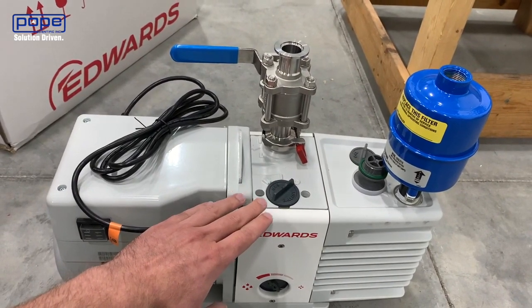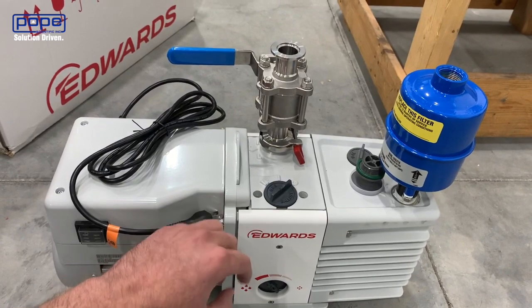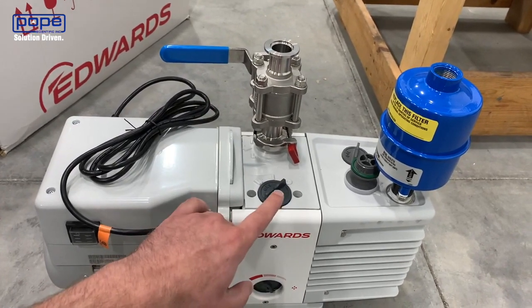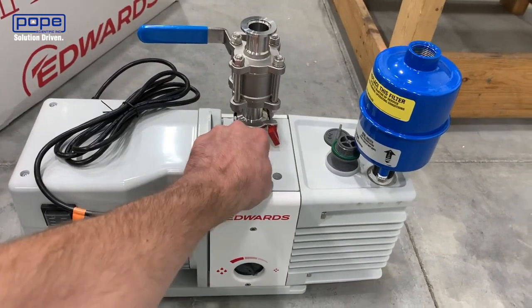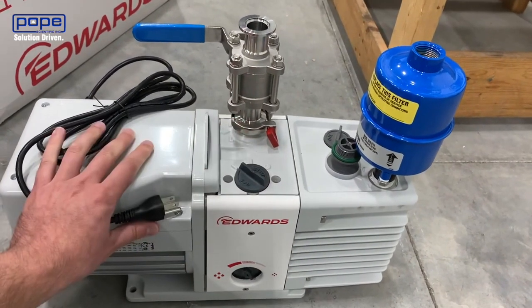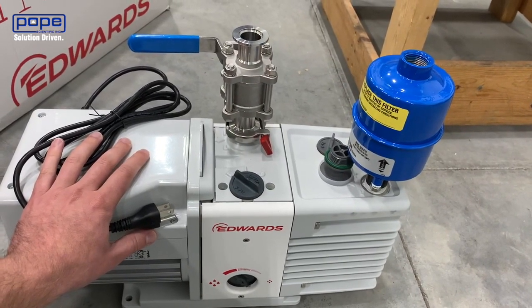When you're using it, you would wait until your vacuum pump is warmed up and then open it by adjusting it from zero to two — just change that switch over to two. This will allow air to flush into the oil and will allow the volatiles to be removed.